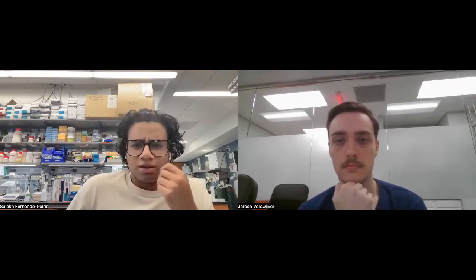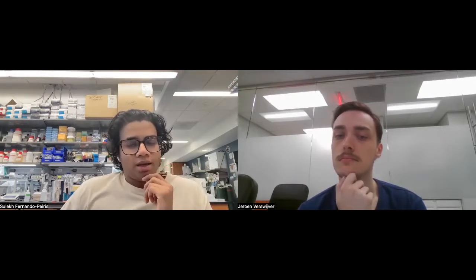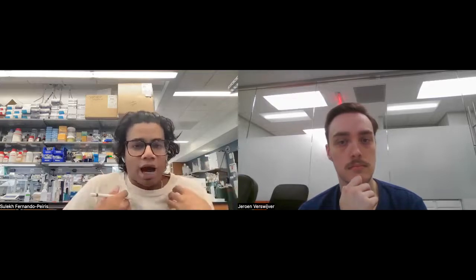As GUIs go, our lab also works closely with the Costa lab at Columbia, which I know also uses DataJoint. They have a GUI that we felt was very efficient, and we wanted to try to get a hold of it, but we also wanted to talk to you guys because I'm going to be here for 2 years but then move on, and we wanted some sort of cohesive process to work with you guys. So we want to find out a little bit more about LabBook. I have a couple specific questions, but I can ask those later, or you can tell me a little bit more, whichever works best for you guys.